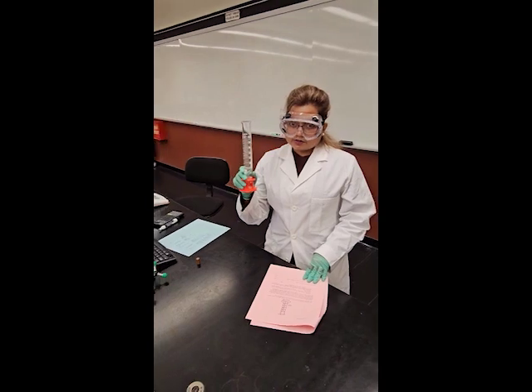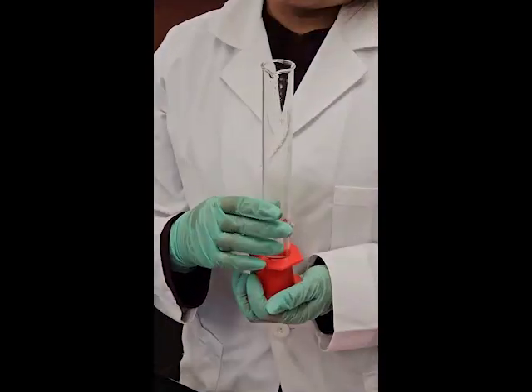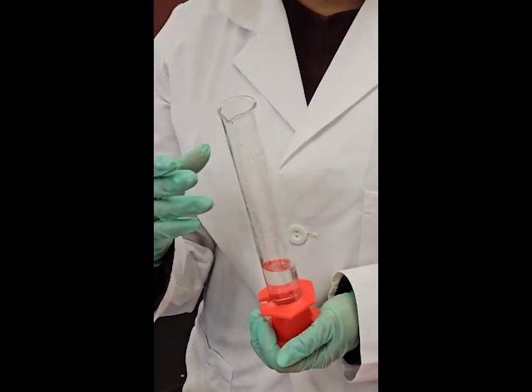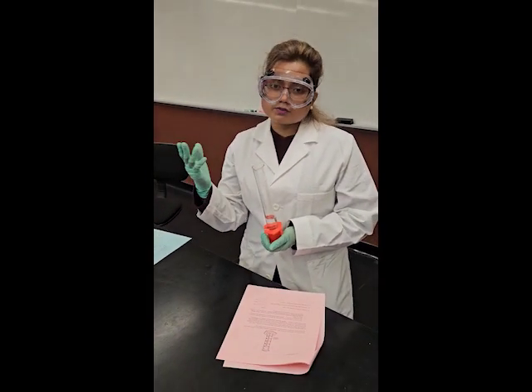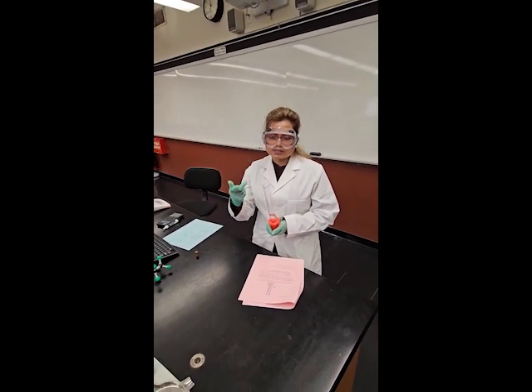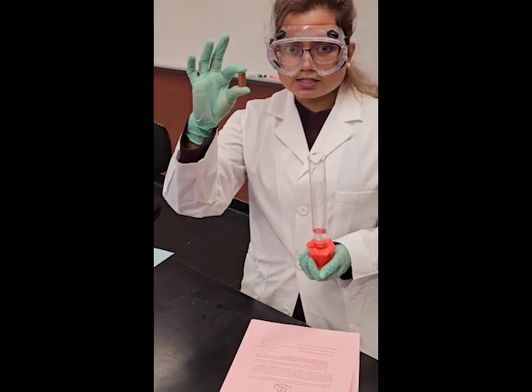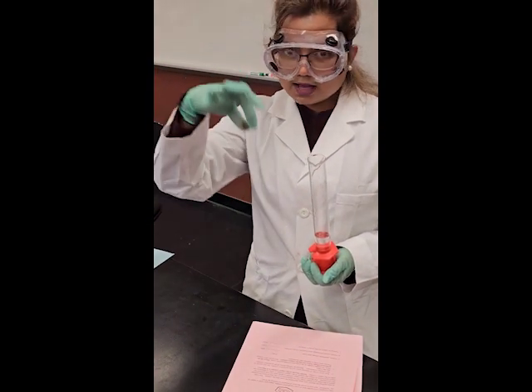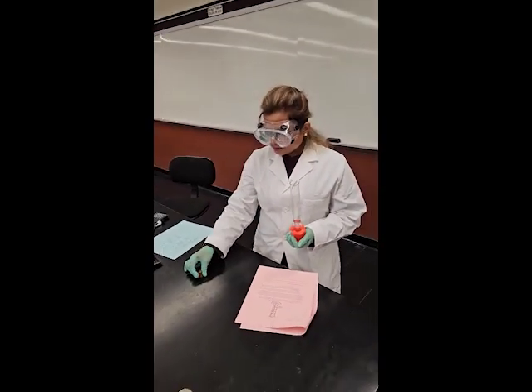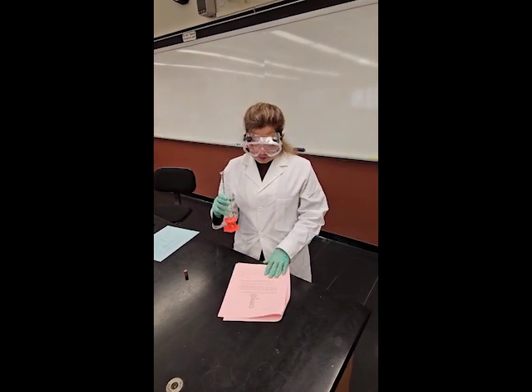This is called a graduated cylinder. You can find in your lab a 10 milliliter graduated cylinder, 100 milliliter graduated cylinder, any of them. So it depends on which one you're using. You have to use some general knowledge, like which one will go inside. Like here, I'm going to use the copper. If I use the 10 milliliter graduated cylinder, I cannot drop it inside. So just common sense. Okay, so this is a 10 milliliter graduated cylinder.